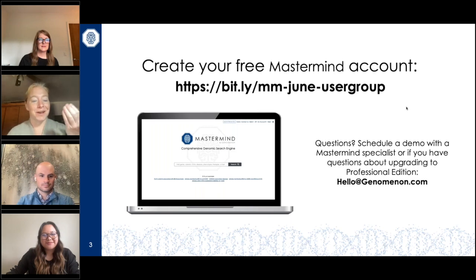Mastermind returns to them saying this article contains your variant and talks about functional changes, or fusions, or whatever Dan and Denise had shown. Then that person reads those sentence fragments, reads that part of the article and says, yes, I agree. This is in fact a good functional article that had all the proper controls. And they will then tag that article as a functional change article for the criteria for ACMG.